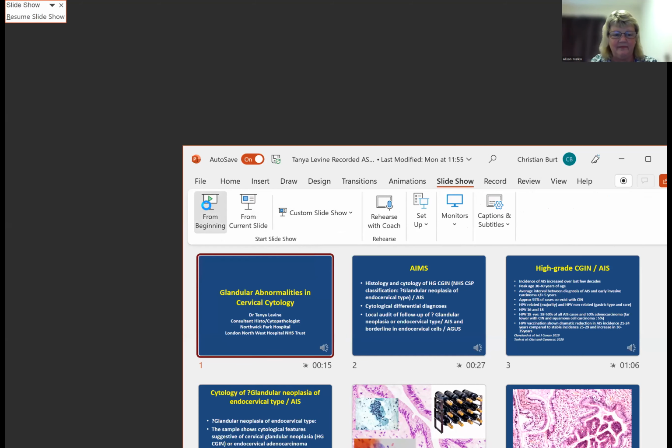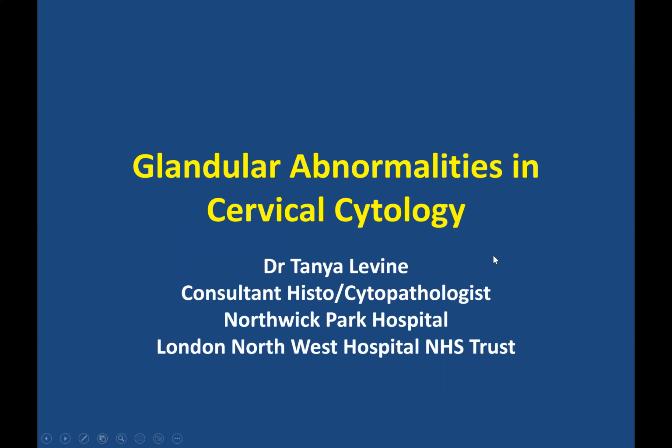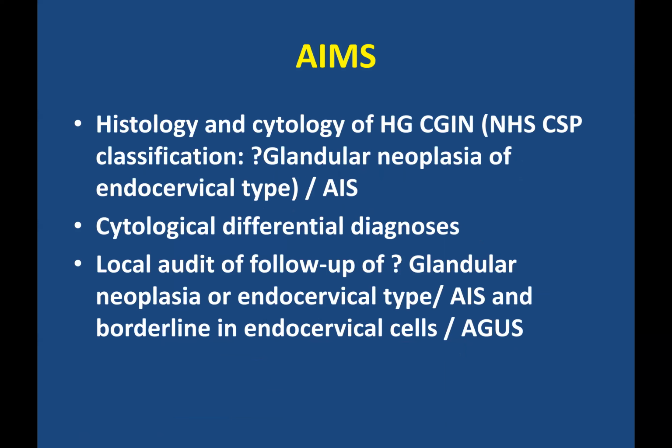Thank you. Hello everybody, it's a pleasure to be able to talk to you today, and over the next half an hour to 40 minutes I'm hoping to give you an overview of the cytological features of glandular cells and abnormalities in cervical cytology. So the aim of my lecture is to give an overview of the histology and cytology of high-grade CGIN. And of course, if you're outside of the UK, you might be used to other terminology such as adenocarcinoma in situ. Then I'll discuss the cytological differential diagnoses, and right at the end I'm going to present a local audit of the follow-up of query glandular neoplasia of endocervical type and borderline changes in endocervical cells.